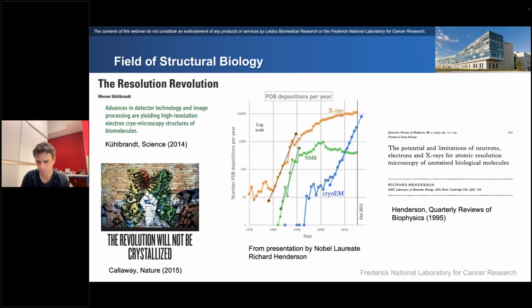So back when it was the low resolution range, before the direct detectors came online, you were stuck in the low resolution range, and you were lucky if you were able to get to, say, sub-nanometer resolution where you could see helices, and then if there was a crystal structure available, you could dock it in and try to make some biological interpretation.